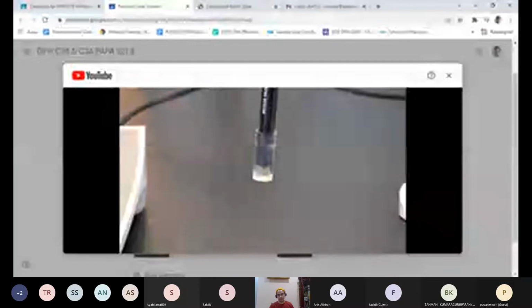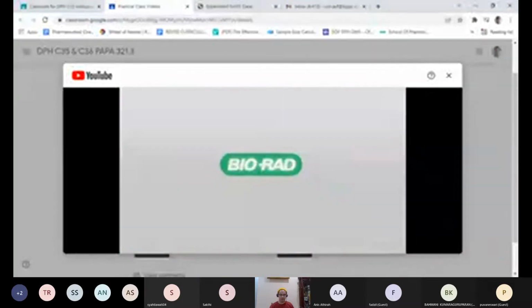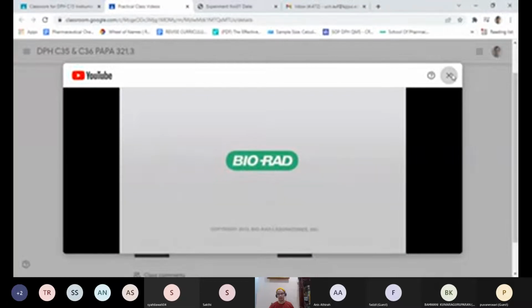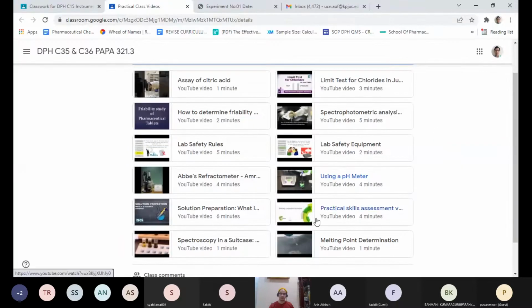Selalunya sampel yang pekat macam cream ataupun suspension, dan sampel yang cair macam salbutamol solution, diphenhydramine solution, buat batuk, semua. So the idea is kalau kamu punya solution tu terlalu pekat, contohnya macam aqueous cream, you will need to do some dilution first, meaning kamu kena cairkan dia.